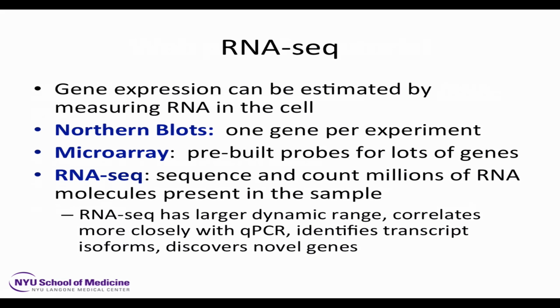Not all of that information is revealed all at once with just one computational approach. You have to go back and dig into the data again and again to answer different questions, but you typically have that same data file, and you can explore it with appropriate bioinformatics tools.